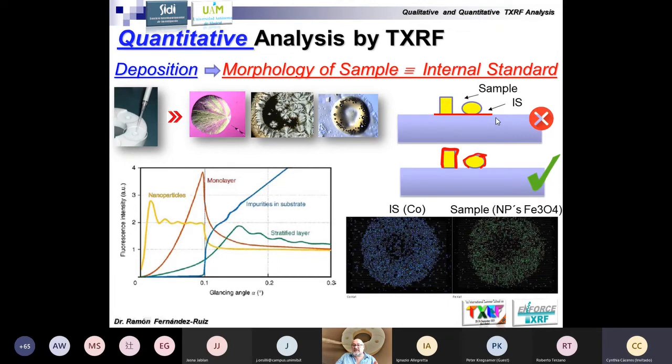With this structure, we surely have lost the linearity and sensitivity relation that we previously found, the relation between the intensity of the internal standard with respect to any element, because the shape and the intensity response are different. So it's critical, take care. I only want to say this. Really, this is not usual, but it's necessary. Always take it into consideration.